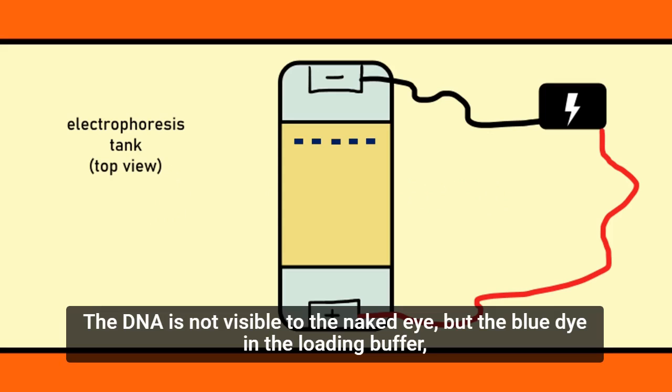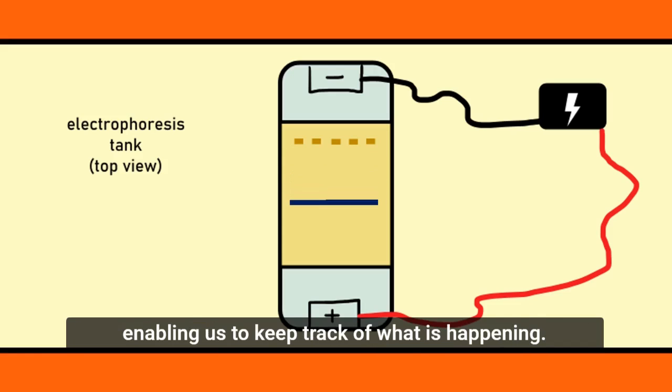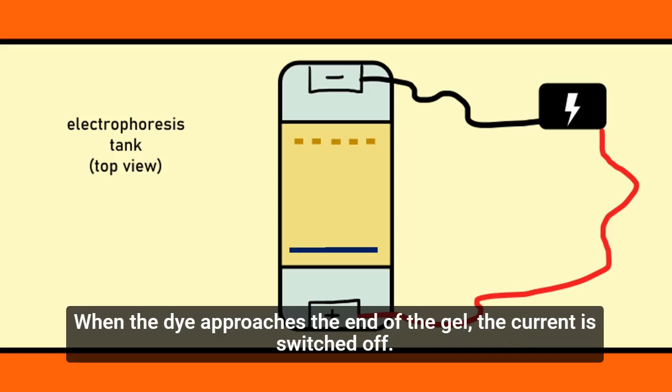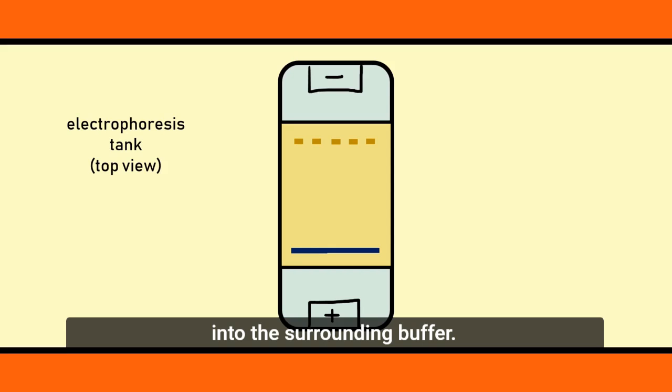The DNA is not visible to the naked eye. Bromophenol blue can be seen migrating through the gel and enables us to keep track of what is happening. The dye, being very small, will move faster than the DNA. When the dye approaches the end of the gel, the current is switched off. If the current was left running for too long, the DNA would eventually run off the end of the gel into the surrounding buffer.